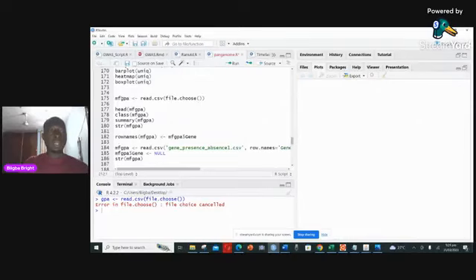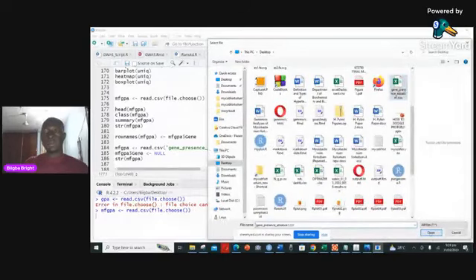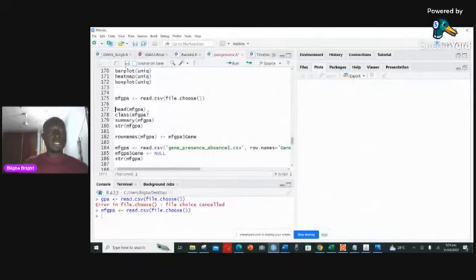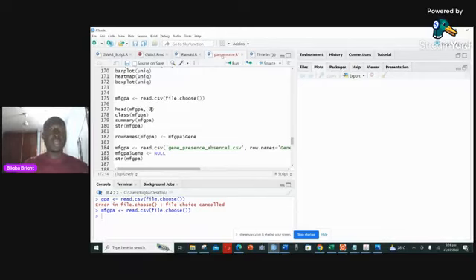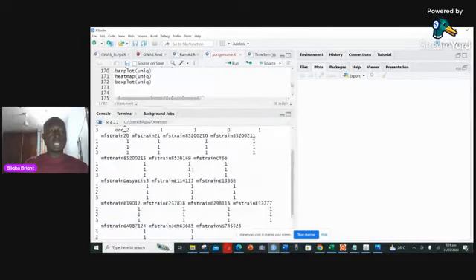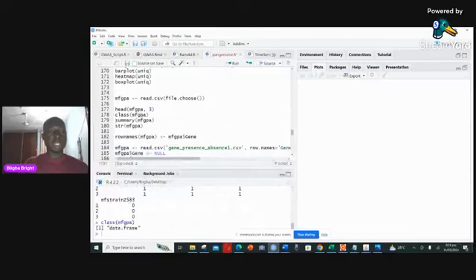I used that and created this variable — MF stands for macrobacteria for teaching — and then the gene presence and absence variable. Now you want to check whether the file loaded correctly, so you do head() to look at the first three rows. You can see the file is actually there. The next thing is to check the class of the data — it's a data frame, as you can see down here.